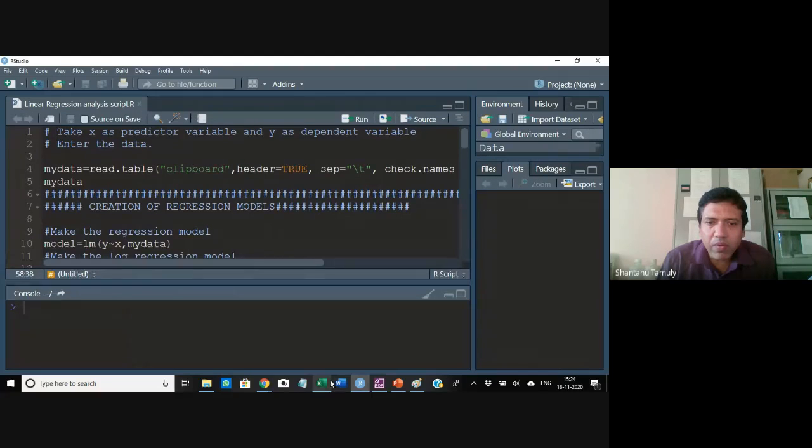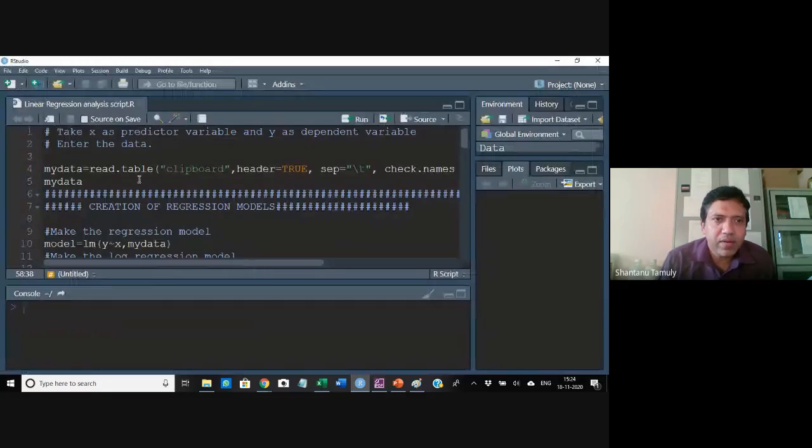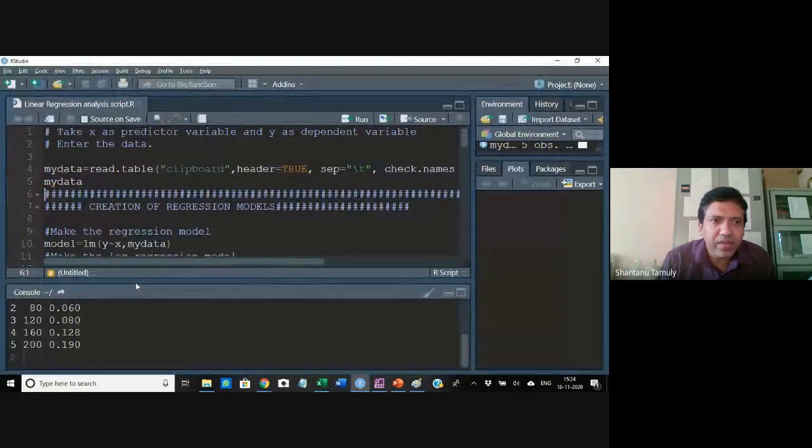Now I'll copy this, come here, put it here and run it. Again, I run it. Now you see, this is my data, which I have entered here.